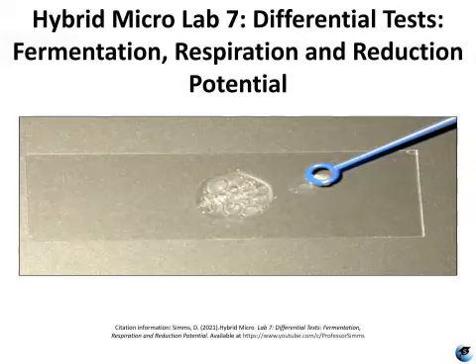Hello, I'm Professor Sims, and in this video I will discuss biochemical differential tests, specifically those related to fermentation, cellular respiration, and reduction potential. This is the 7th in the series of 10 lab sessions held as part of my Laboratory for the Fundamentals of Microbiology course.